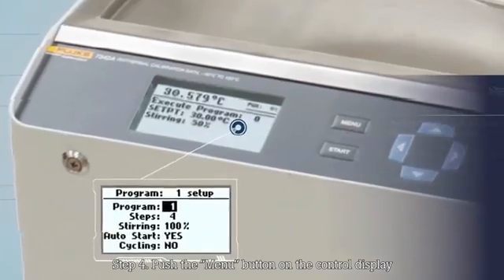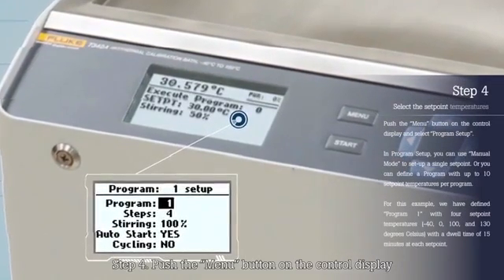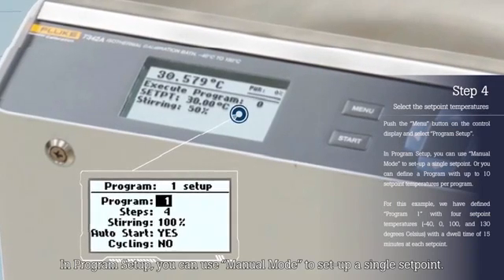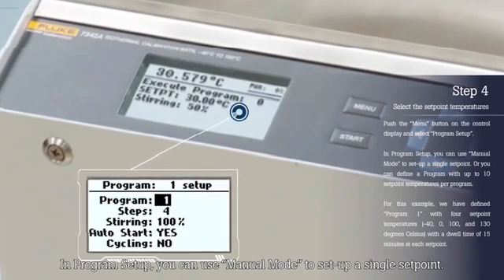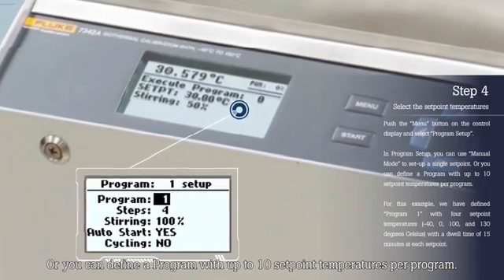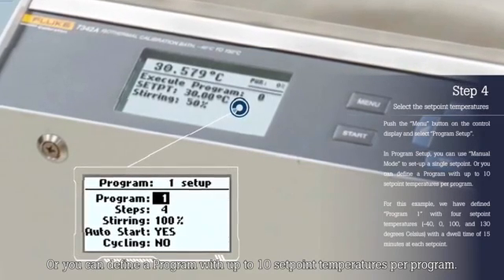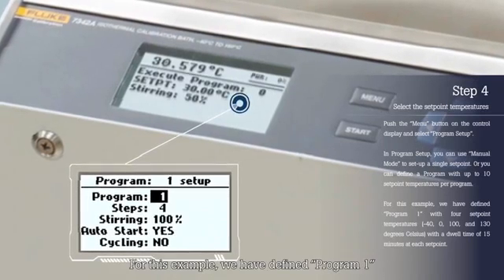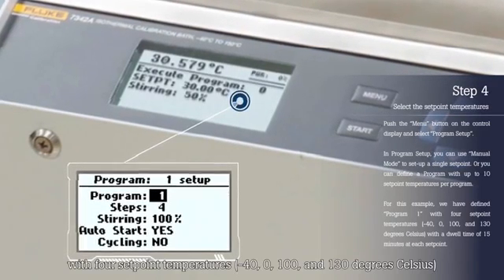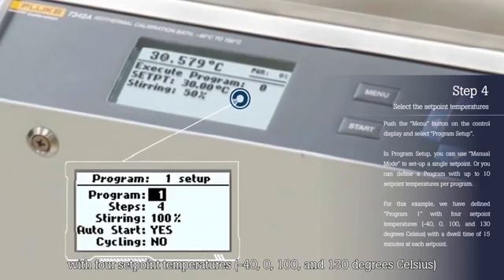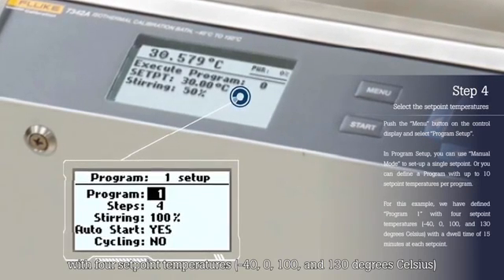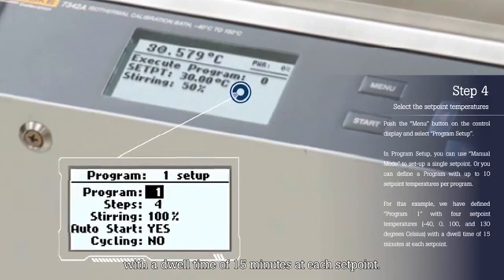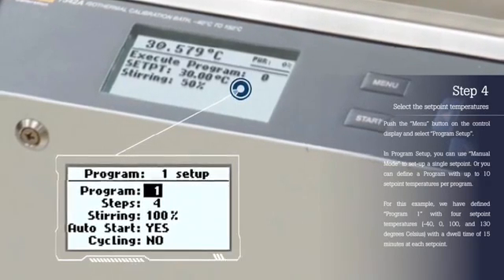Step 4: Push the menu button on the control display and select Program Setup. In Program Setup, you can use manual mode to set up a single set point, or you can define a program with up to 10 set point temperatures per program. For this example, we have defined Program 1 with 4 set point temperatures: minus 40, 0, 100 and 130 degrees Celsius with a dwell time of 15 minutes at each set point.